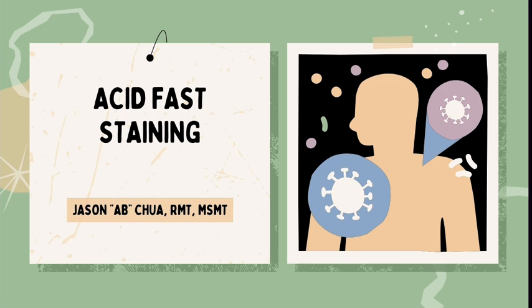The acid-fast stain determines if the blood, tissue, or other body fluids is infected with mycobacteria, which can cause diseases such as leprosy or tuberculosis, commonly known as TB, or Nocardia, which is a bacteria found in soil and water that may affect the lungs, brain, and skin.